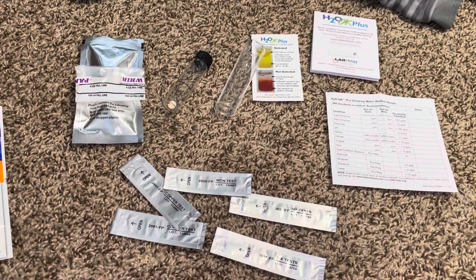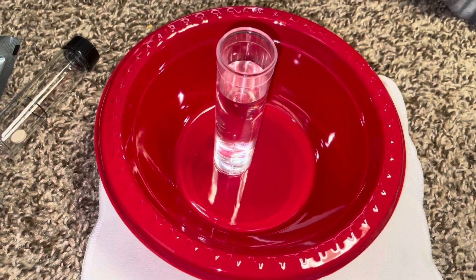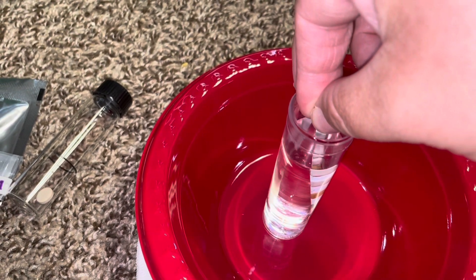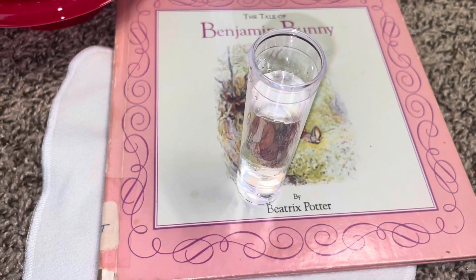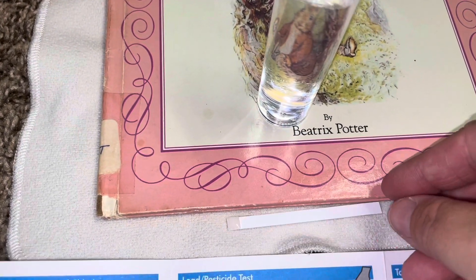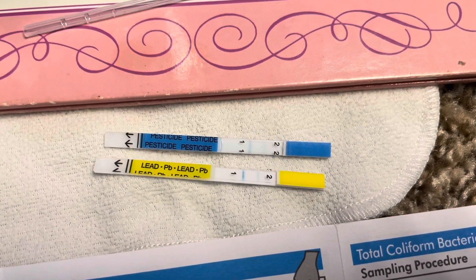I am going to read the instructions and get started. I filled up the tube — this is the six-test one. I'm supposed to dip it for two seconds, then shake it lightly and read immediately. So I dipped it, shook it, and read the results immediately. Here is the iron test result, and this is the lead and pesticide testing.